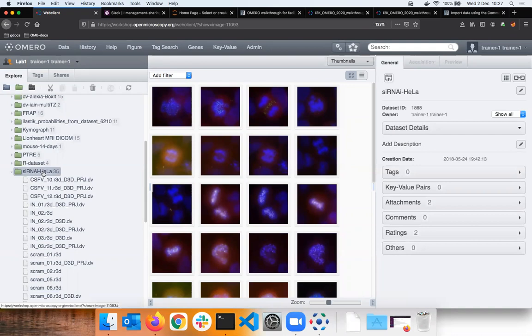But what Sylvie is looking for is again another layer on top of that. On that, you will need a job that will watch the directory of the user, and when something new comes in, either automatically or at night, that will kick off that script basically. And for that, we do not yet have those example scripts, because that really depends on the type of OS or machine you will have.